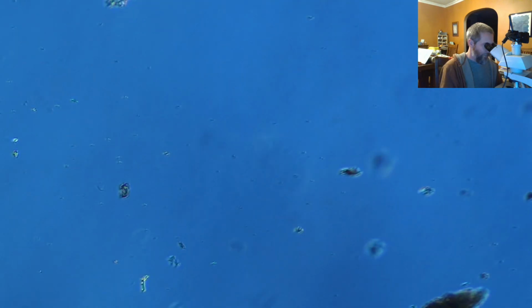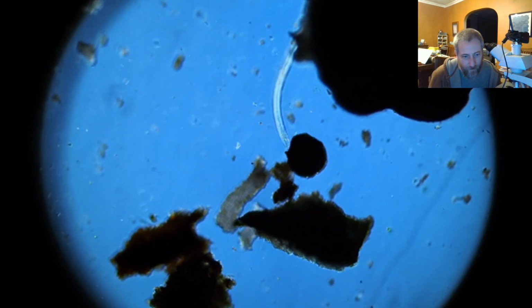My slide's actually starting to dry out, and that's a consequence of us streaming for a little while. So what I've been doing is I have a pipette here, and it's got a little bit of junk in it. Hopefully you can see that. I'll put a little bit more on, and it'll mess up the structure of what we have in the slide, but it'll also give us a little more time with whatever we have, and maybe I've introduced some more water bears or rotifers in the process, because I let these things settle to the bottom of that pipette and squeezed out a little more good stuff. So it's very likely that I injected, oh, here's a nematode that wasn't in here before. As an example, there's a little nematode worm squiggling about. Let's zoom out so you can actually see it. There you go. That's kind of nice.